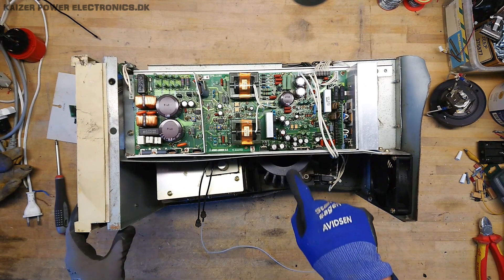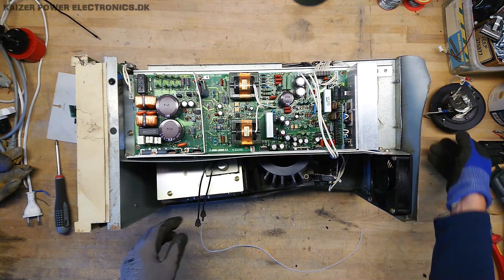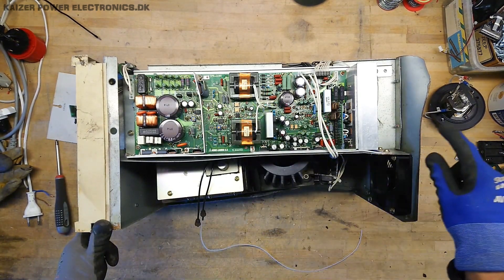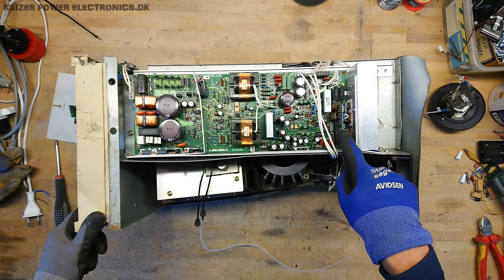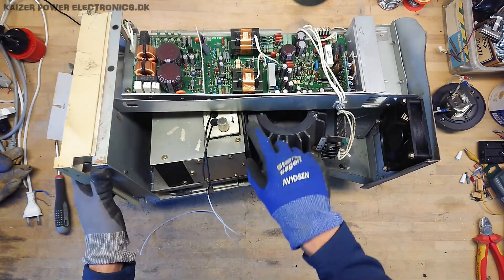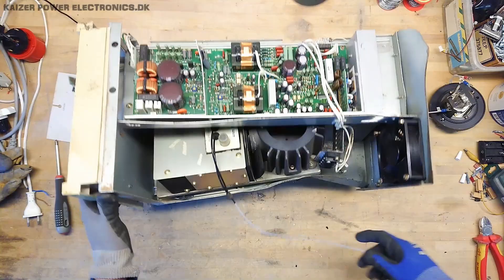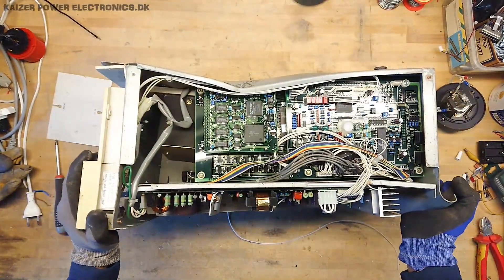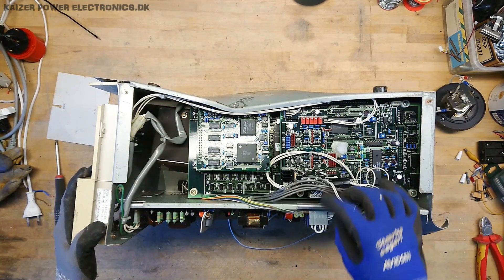There seems to be some kind of light chamber down here where the lamp would be mounted. We have a dual power supply, some heat sinking at the back — probably some driver boards. This looks like the analysis chamber, as we have the inlets and outlets for the liquids. Over on the side we have all the control electronics.